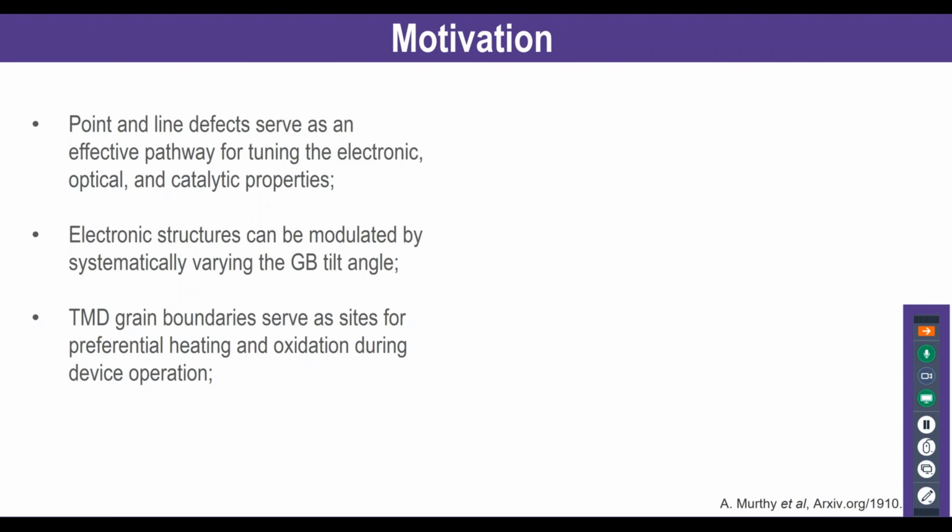And also for unconventional two-dimensional materials such as molybdenum disulfide and its variations. For TMDs here, grain boundaries have been shown to serve as sites for preferential heating and also oxidation during real device operation.